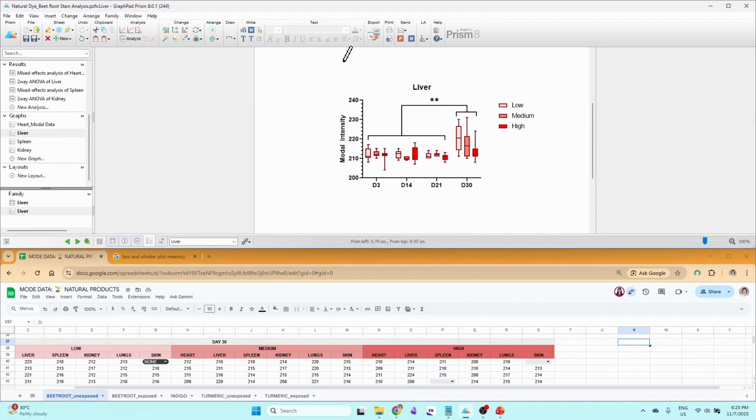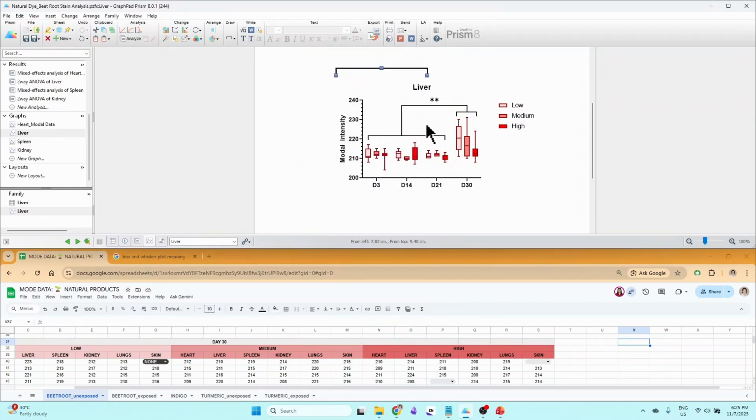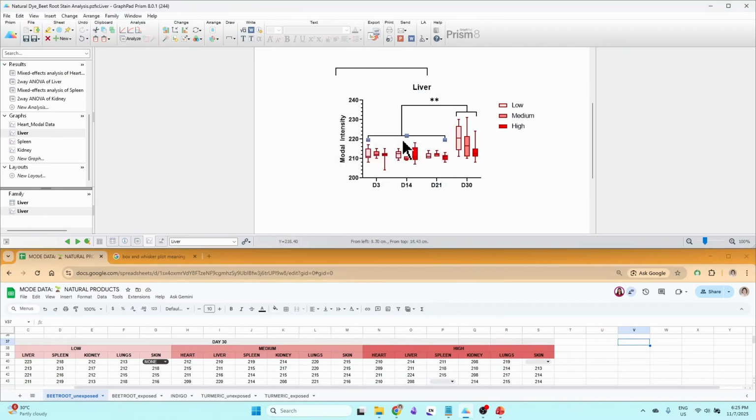So you just use this one and draw. Okay, and you can see that by default its thickness is 2 points, but I just use 1 point. Okay, so we just use 1 point. Just use whatever I have preset already. Okay, so you can double click and check the settings and parameters of what I have used.